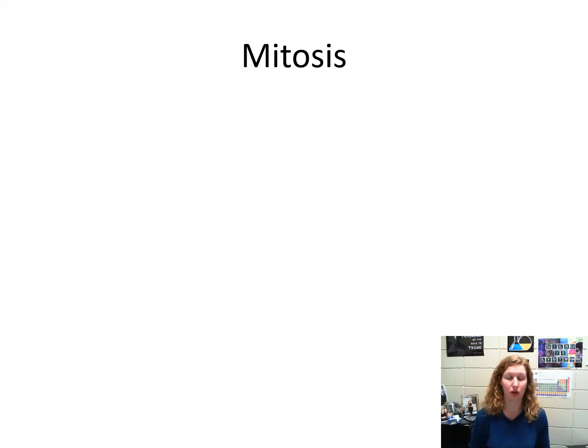This is a review PowerPoint showing some images of various stages of mitosis, embryology, and histology. So when I start this slideshow, what I'm going to do to help you study is I'm going to show you the picture and I'm going to wait for a few seconds and then I'm going to tell you what it is. So that way you can sort of quiz yourself, or if you want to mute the video and practice and then let the subtitles, they'll show up after a brief period so that you can get some repetition on your own. So here we go.